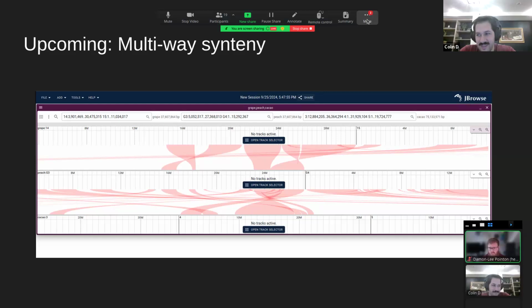And that can be really interesting. It's like do something that we never envisioned JBrowse would do. I think it's quite cool. I recently have had a long effort to integrate a 3D protein viewer into JBrowse. And it is actually able to have this integration where you mouse over the genome and it shows you where that is on the protein, and vice versa.